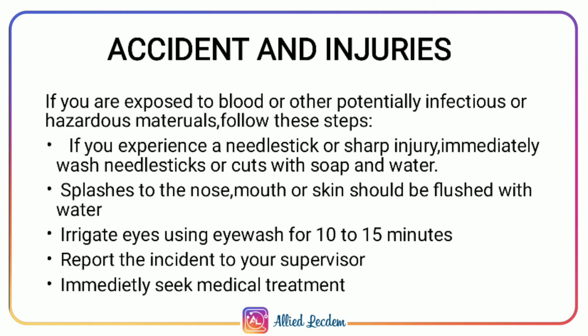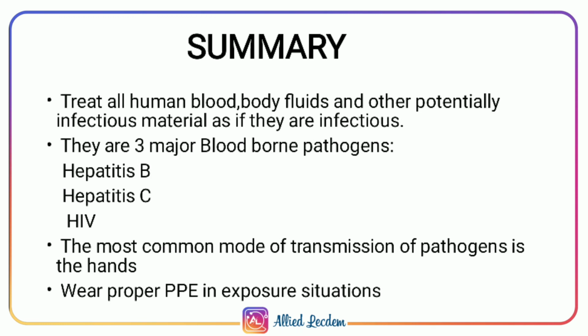Accidents and injuries. If you are exposed to blood or other potentially infectious or hazardous materials, follow these steps. If you experience a needle stick or sharp injury, immediately wash needle sticks or cuts with soap and water. Splashes to the nose, mouth, or skin should be flushed with water. Irrigate eyes using eye wash for 10 to 15 minutes. Report the incident to your supervisor. Immediately seek medical treatment.